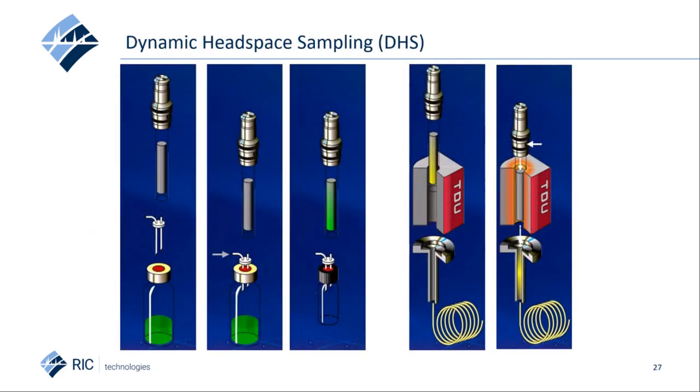From left to right, this slide summarizes all steps performed during a classical dynamic headspace enrichment. A double needle lets in the carrier gas into the sample vial. The headspace is purged and compounds are enriched onto the high-capacity trap. Optionally, a dry purge step is performed using an empty cavity or vial to perform water management of the trap. Then thermal desorption is performed. Compounds are trapped in the PTV injector before they are transferred to the column by rapidly heating up the injector. An MPS robotic system mounted on a GCMS equipped with the DHS hardware is shown now.